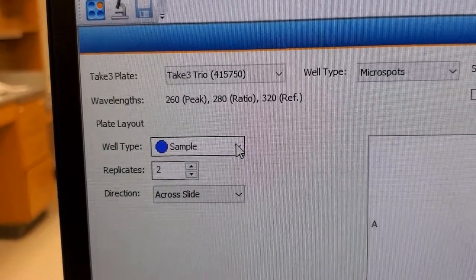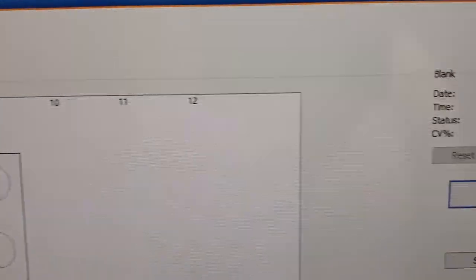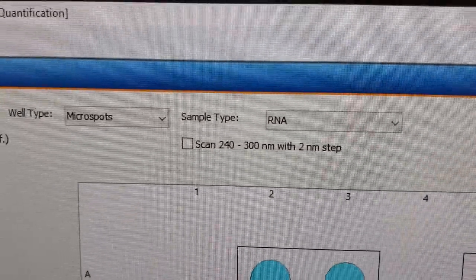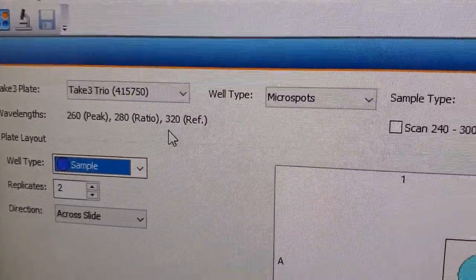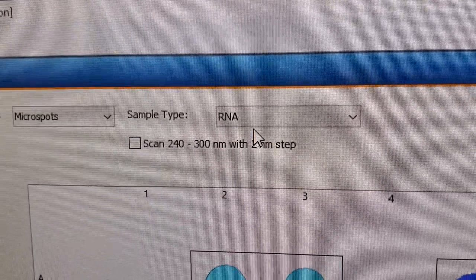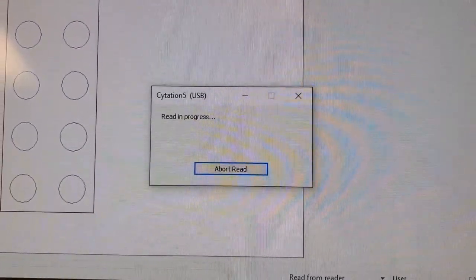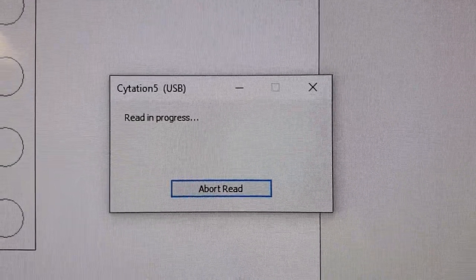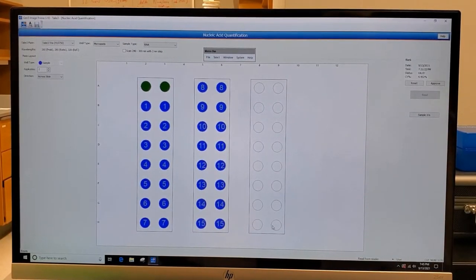Here's a close-up of the software: under 'Well Type' you click empty, blank, or sample. Under 'Replicates' you set your count. Up top you can see the program details — wavelength 260, 280 ratio, 320 reference. You set the well type to micro spots and sample type to RNA. While the Citation 5 reads your samples, a window shows 'Read In Progress' and you can hear the machine running.